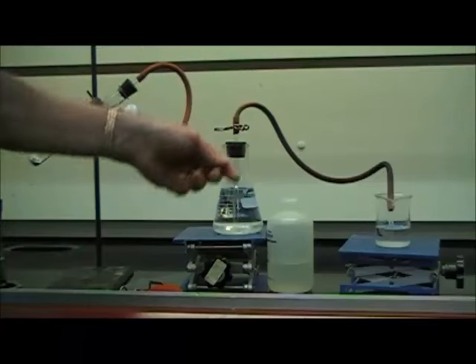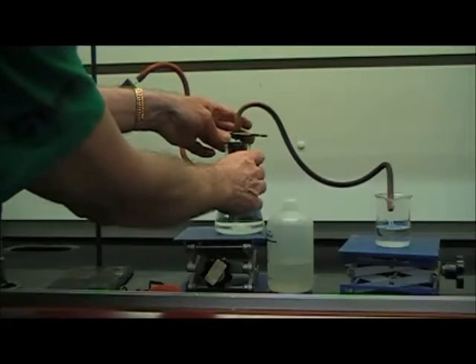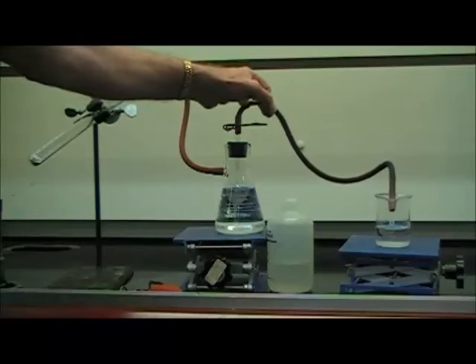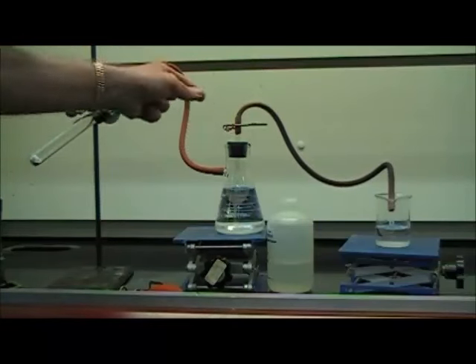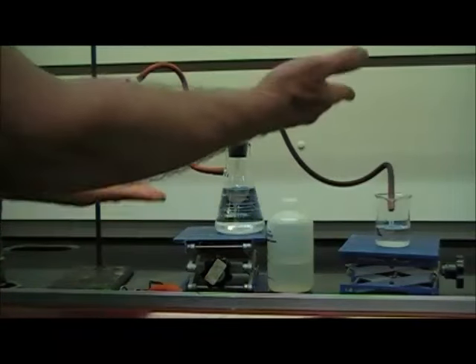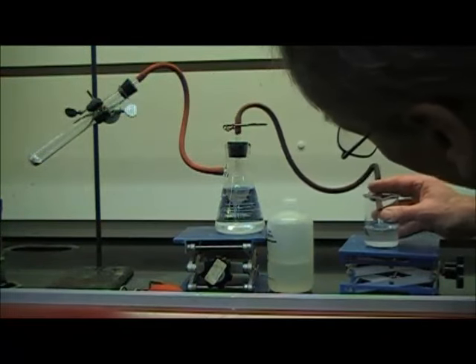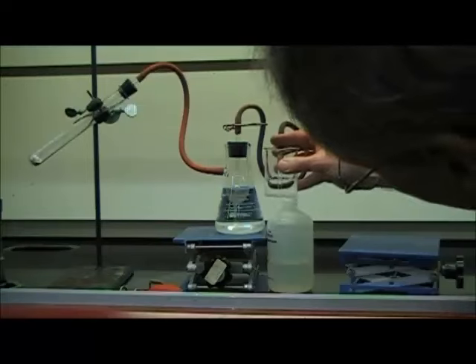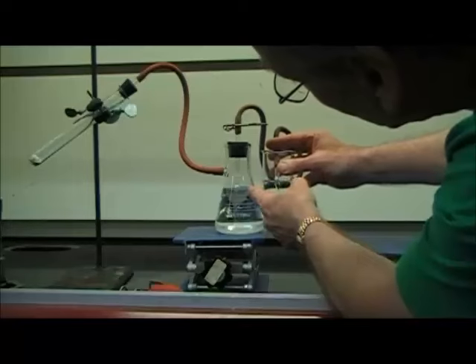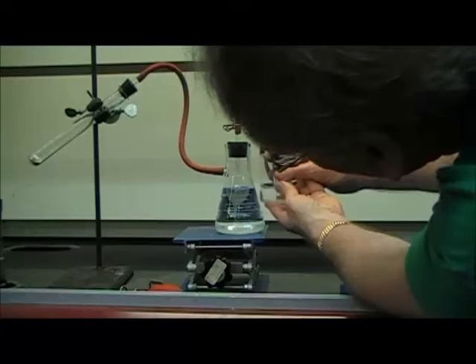Now notice that I have this pinch clamp on here. At the moment it's sitting on the glass tubing that's in here, so it's not pinching off this tube. But in a minute I will move it so that it's pinching off the tube. At this point what I want to do is level the two sides. So I'm going to raise or lower the beaker. I can just hold it right over here. Move this out of the way. And I want the level in here to be the same as the level in here. Okay, there we go. They're about the same level.